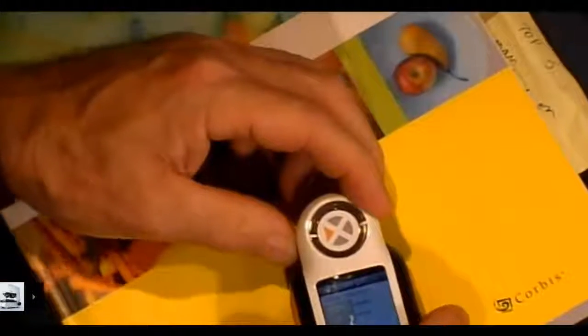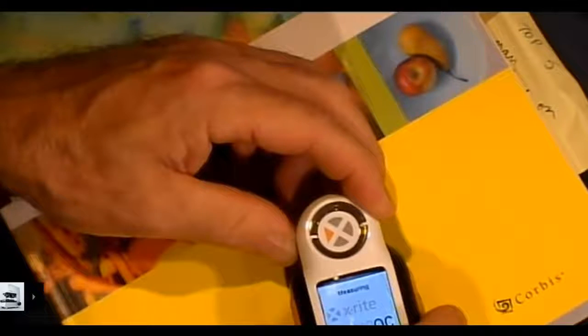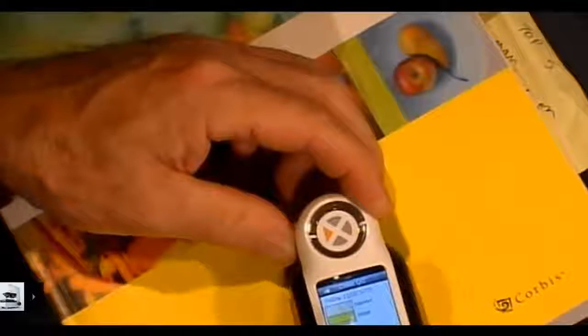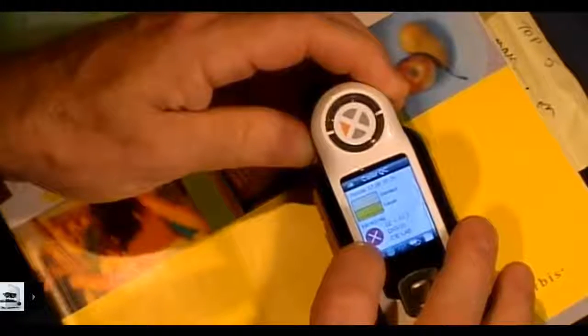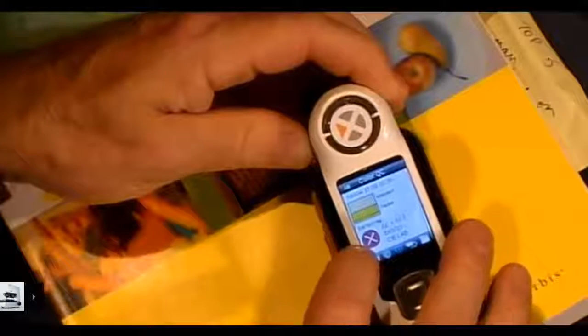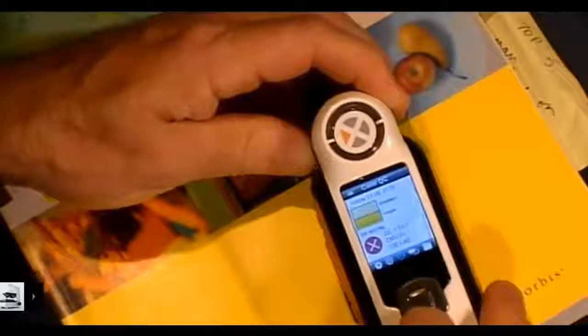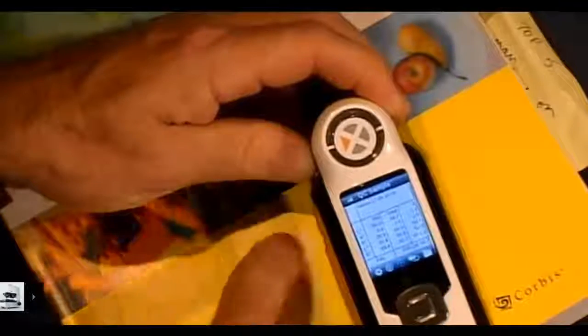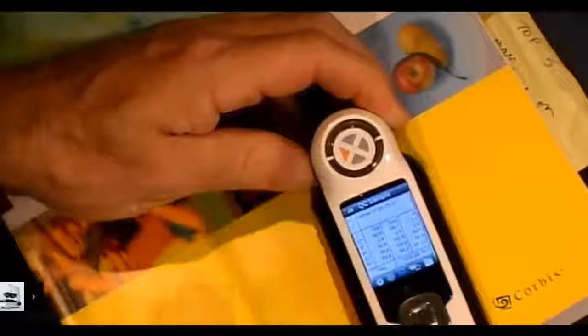So I come over here and I'm ready to take my sample. I take my color, and sure enough, a big red X mark tells me that this sample failed. It also tells me how far off it was, and if I want, I can look at the color attributes of what I just took a picture of, and it would tell me what the color actually is.